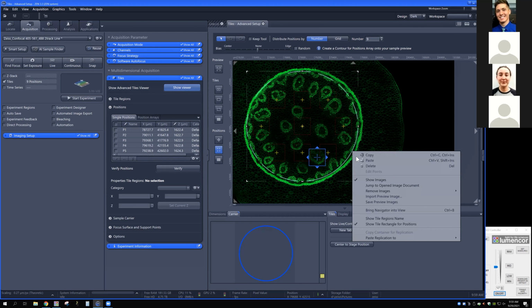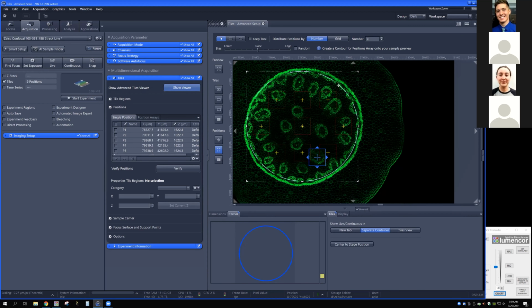Let's see if I delete it. Didn't really need to delete it, but let's say if I randomize, you can also bias. And so you can move things more towards the center, more towards the edge. Let's see when I paste. Yeah, it still is the same. So then we'd have to redraw to change the distribution. So there we are, randomized closer to the edge.